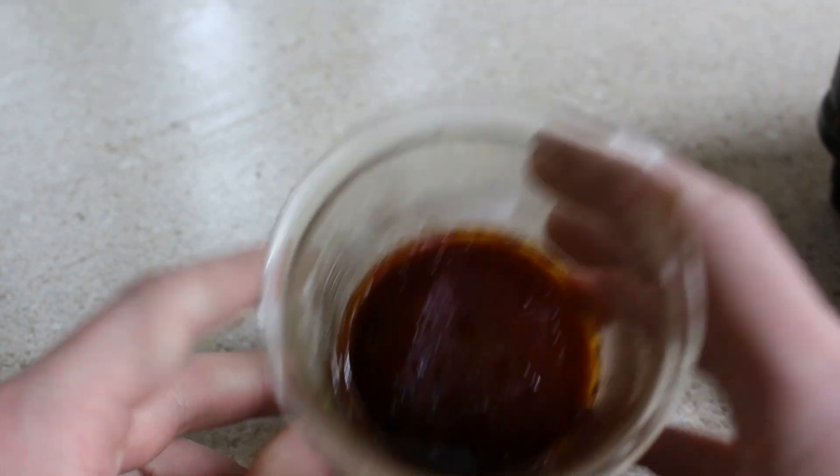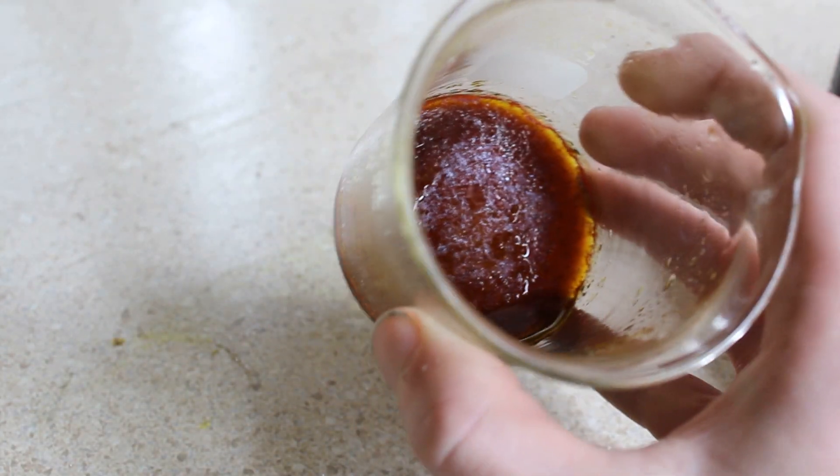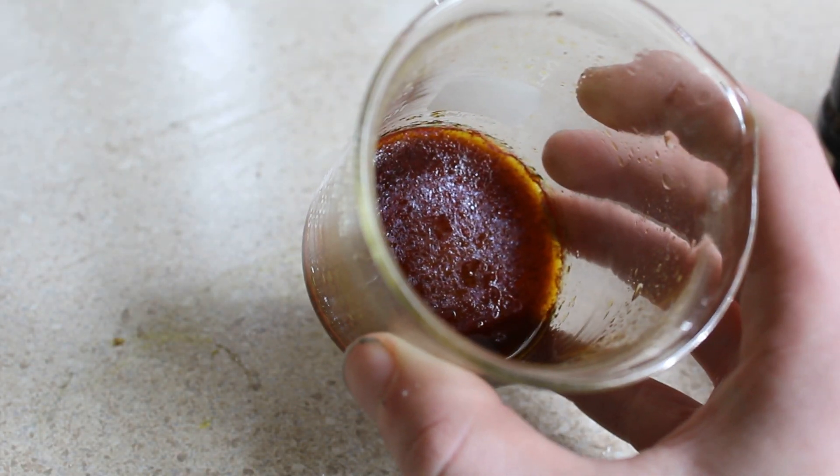I pour off what I can into a waste beaker, and I start trying to concentrate the solution in my oven.